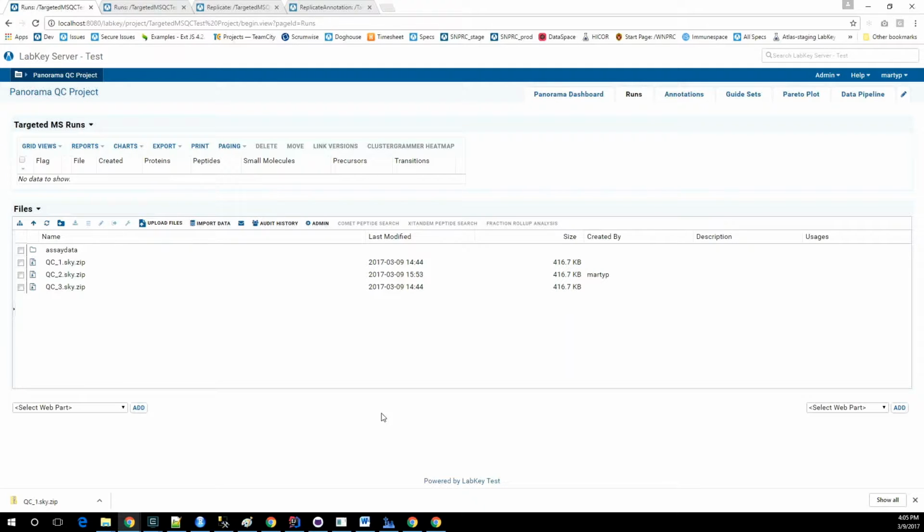However, there are two issues with doing it this way. One being that a copy of the Skyline file that was uploaded was attached to the new samples every time they were uploaded. The file was as is, including the previously uploaded samples. So these files would actually add up over time. They're not very big files, but they do take up space on the server when there's quite a few of them, and most of that data is just duplicate data.